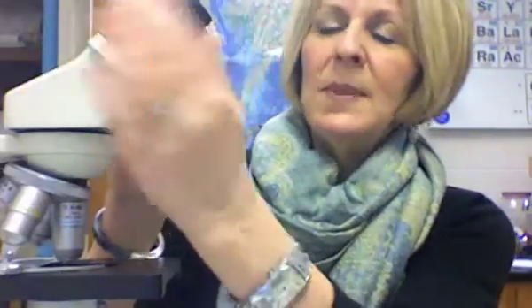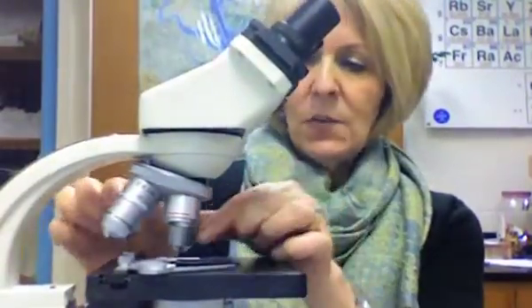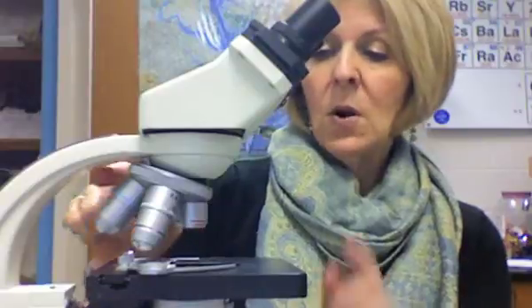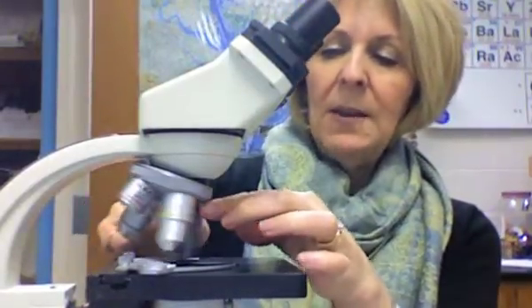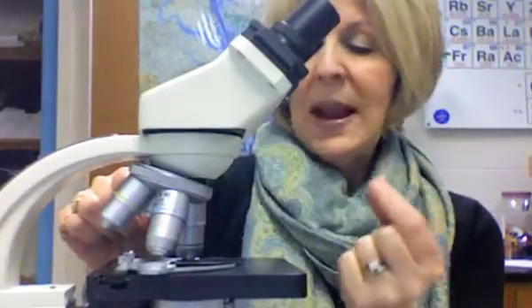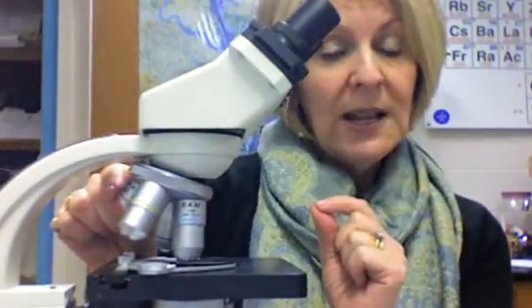The microscope I'm showing you now is a nice binocular microscope, so you can adjust the eyepieces to fit your eyes. The first thing you're going to notice is that there are objectives — these little cylinder things. Usually there are four on a microscope: the shortest is low power, then medium power, then high power, and then one that says 100X.